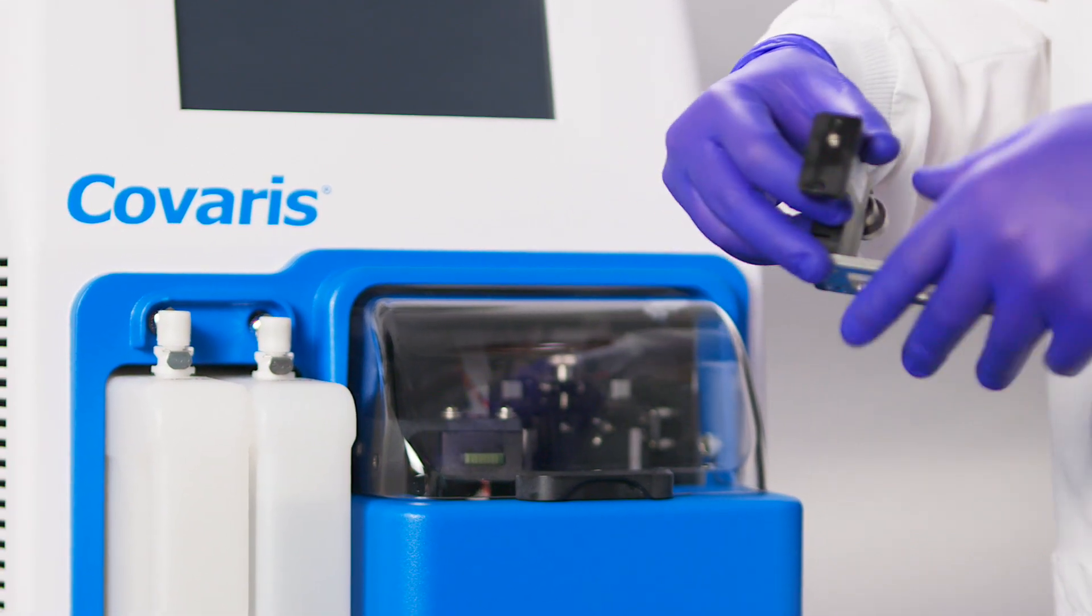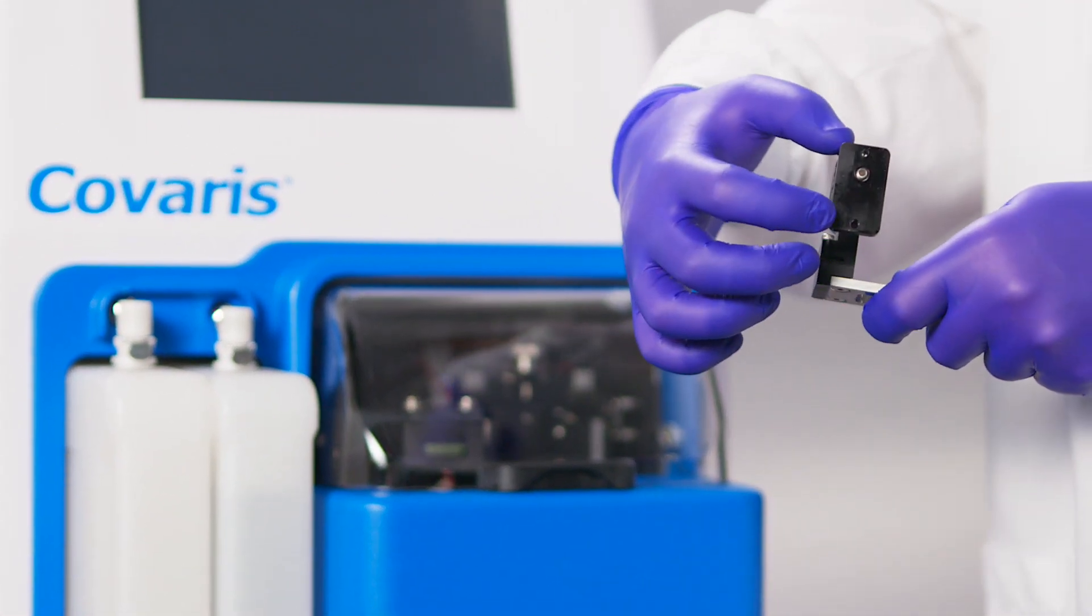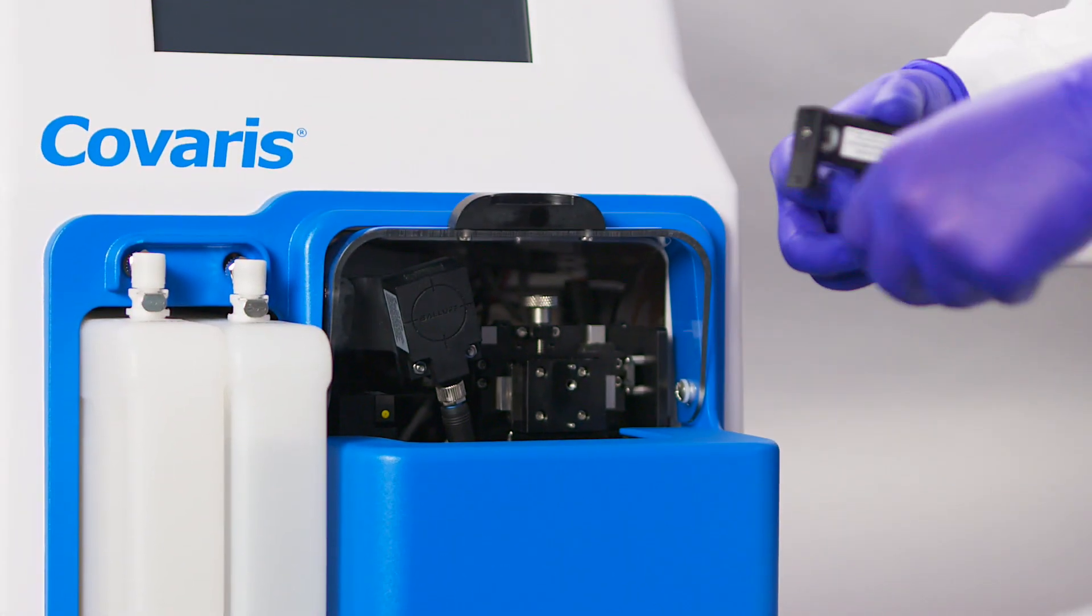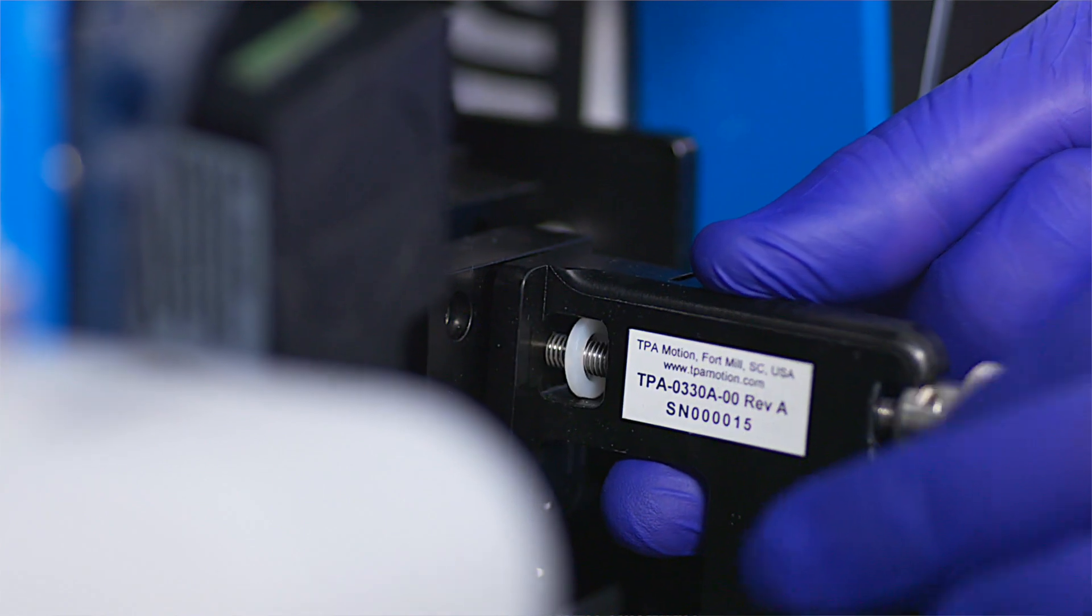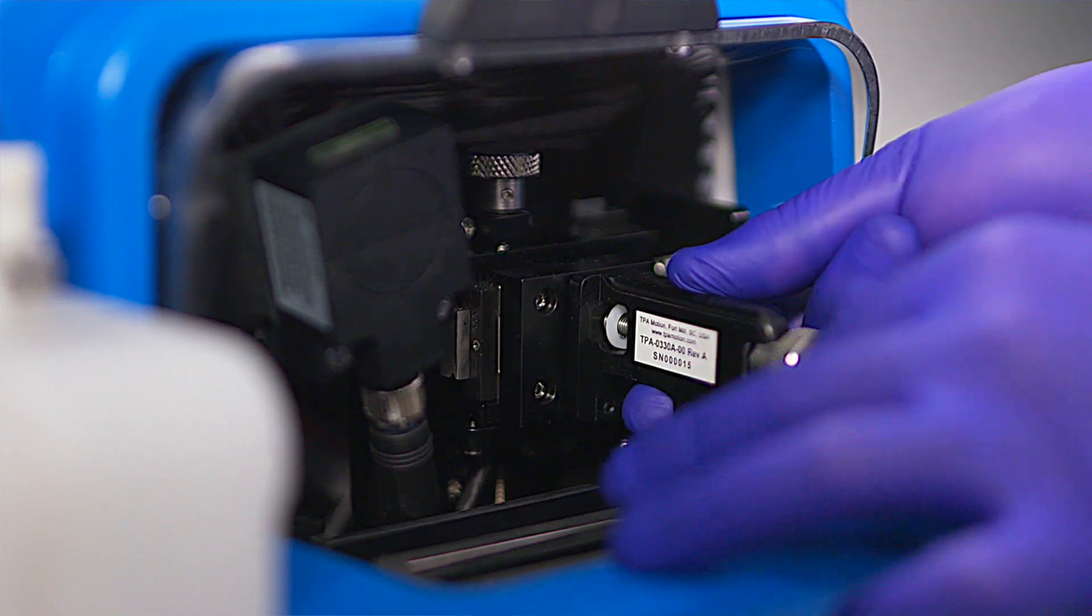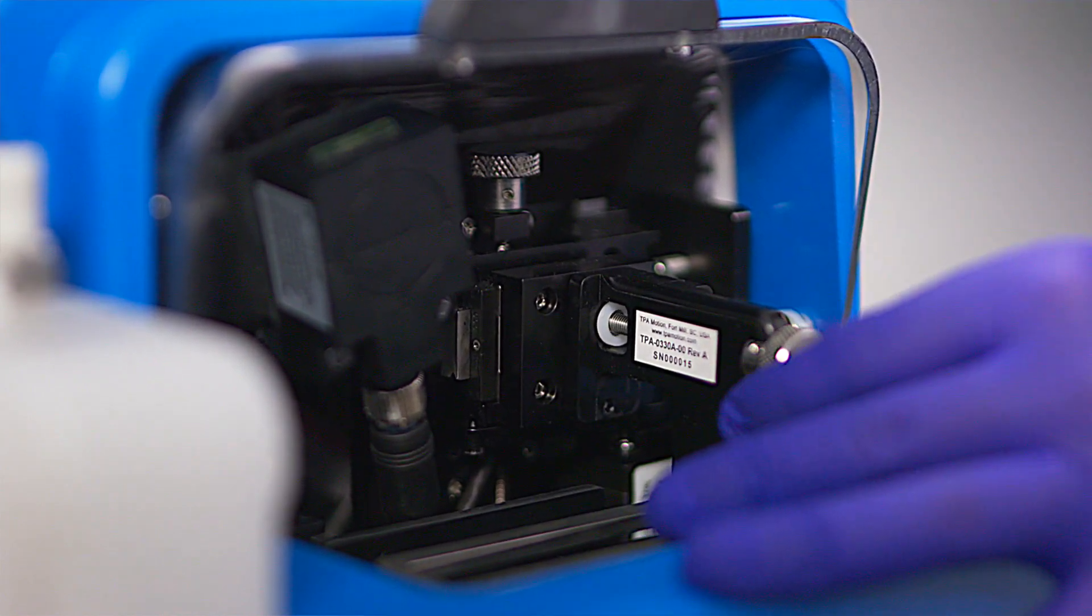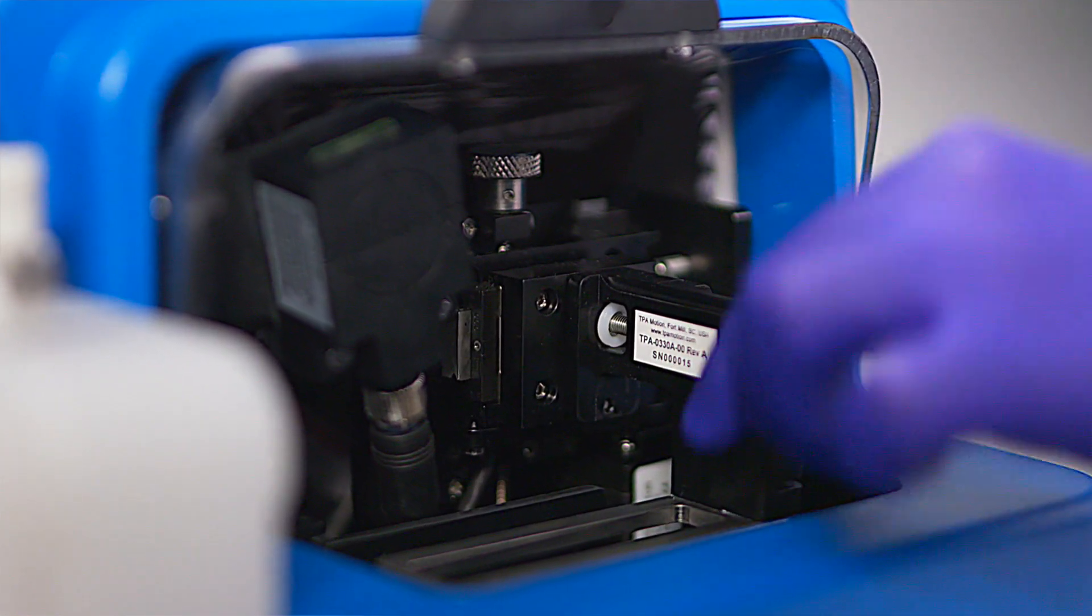Locate the sample tray assembly in the accessory box. Lift the safety cover to open. Slide the sample tray assembly locating pinholes onto the pins of the motion system behind the safety cover. Thread the sample tray assembly's thumb screw into the motion system and snug it finger-tight.